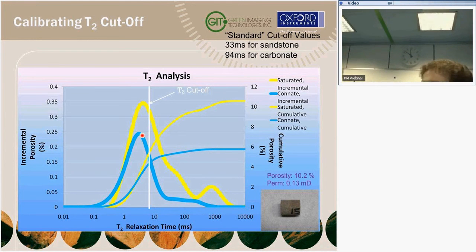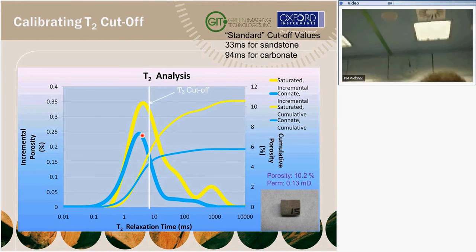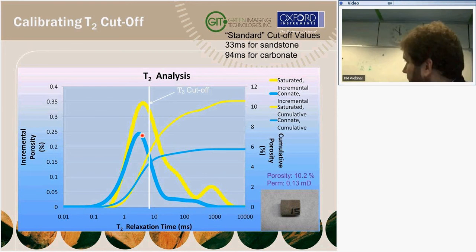standpoint. If you have a light oil that's very light, its diffusion coefficient will be the same, so that we can't distinguish them. In instances where we can see the differentiation, yes, we can quantify how much oil, how much water. So we can look at the oil saturation and the water saturation. Or you can do additional things.